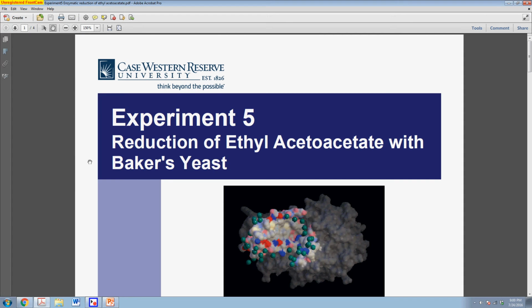So this is the lecture video for experiment 5. There's a few key things that I want to touch on in this lecture video. It is also important to note that this reaction has already been started for you.